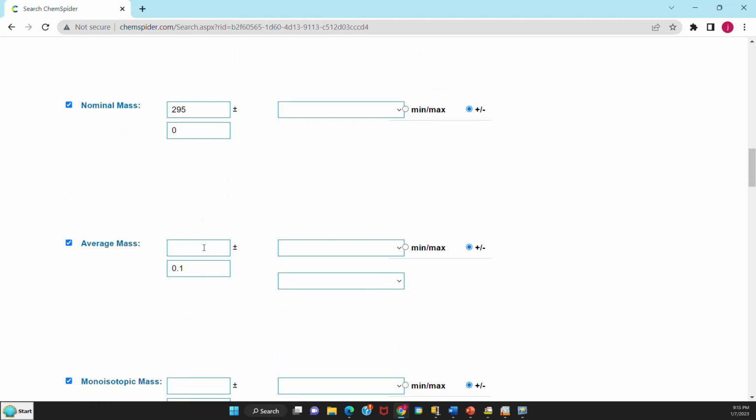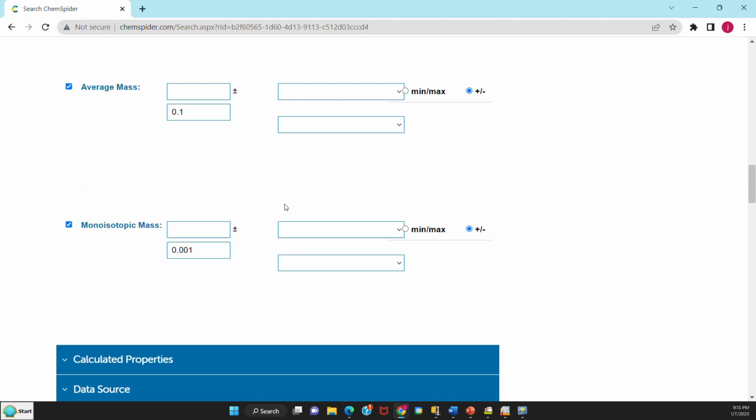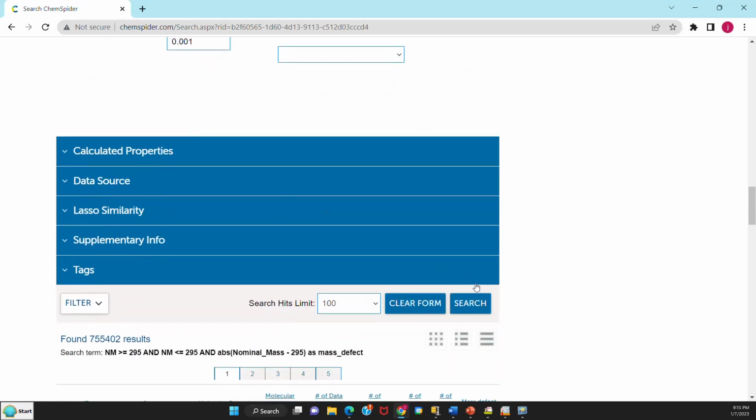And again, the results that I gave you a minute ago, that took probably close to a minute. So all these software searches, these database searches, in some cases, depending on what they are, can take up to a minute to do. So be patient and give the program time to look at the result, to give you the results. So I think I've got everything set up right.